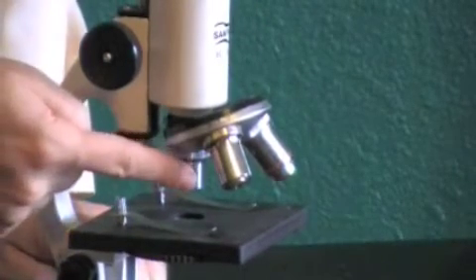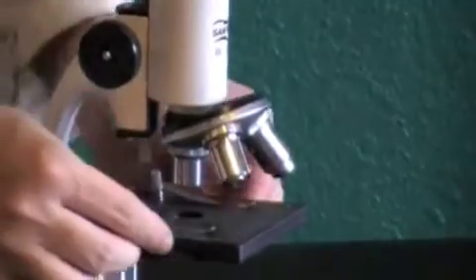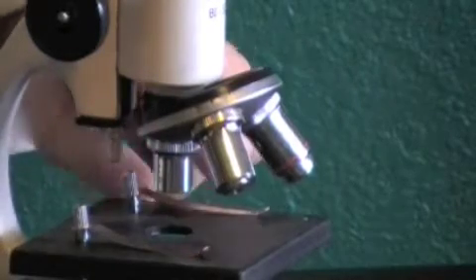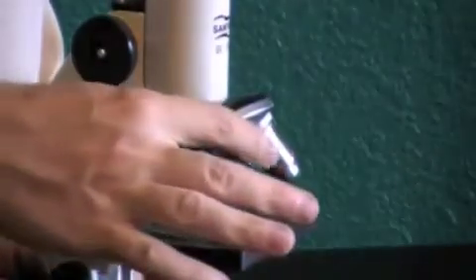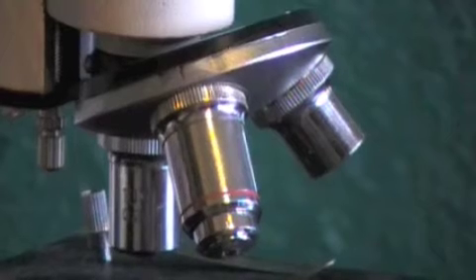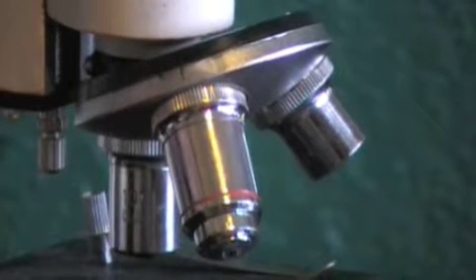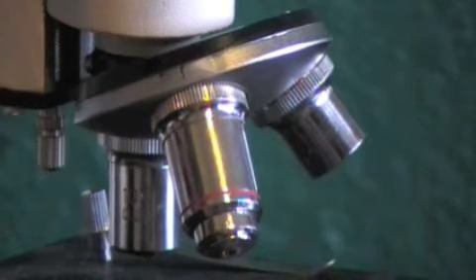Now, put your eye to the ocular lens, focus with the focusing knob, and move your slide around. You may need to move your slide around a little bit to find what you're looking for. But once you find it with your scanning objective lens, focus in, get it in really good focus, then you're going to move to your second lens. Your second lens is your low power lens. Your low power lens is a 10x, so it's a 10 times magnification. Look through your ocular lens again, focus a little bit more because you're not going to have it quite in focus, but you should be close. So focus it in, get it really sharp focus, that way you can see what you're looking at.